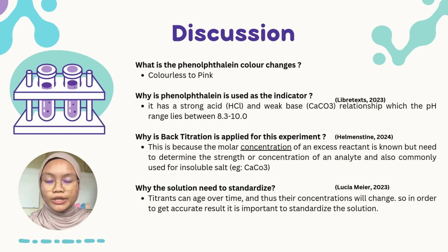Then, why is back titration applied in this experiment? This is because the molar concentration of an excess reactant is known but is needed to determine the concentration of an analyte, which is also commonly used for insoluble salt. In this experiment, it is calcium carbonate.